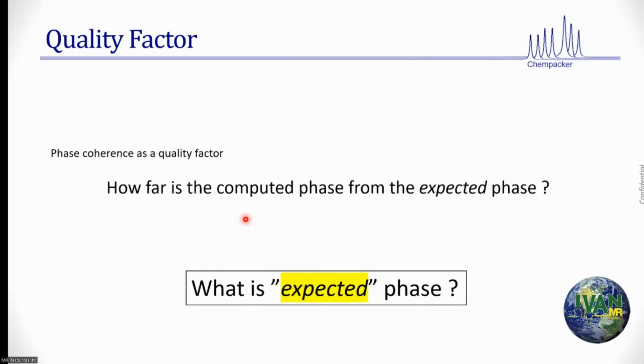All our phase corrections are 2-point phase corrections, at the most 3-point phase corrections. We put our cursor on one end of the spectrum, phase correct it, and call it 0th order, then pivot against that, go to another end of the spectrum, phase correct it, and say, that's my first order because I'm pivoting out of this. And we say, beautiful, I phase corrected it. All you did was a 2-point correction. You need a lot more to get your confidence level up. You rely upon the fact, which is truth, that your phase error is linear. And you simply said, that's linear, but I don't know how to do every one of them independently. I'm just going to take 2 points and do it, and then trust that. That's a problem.